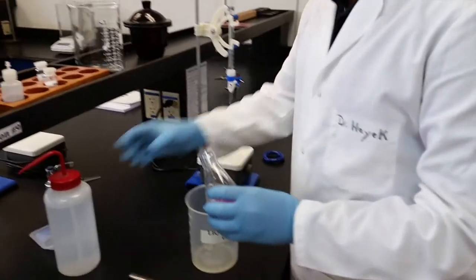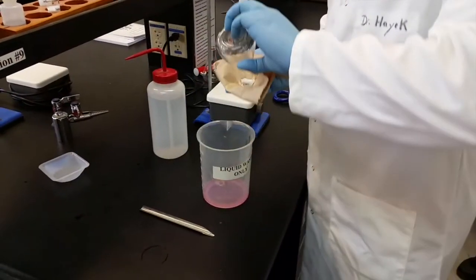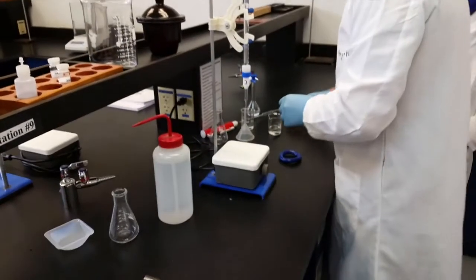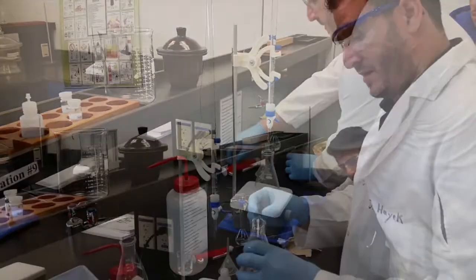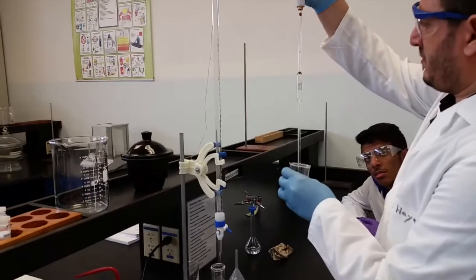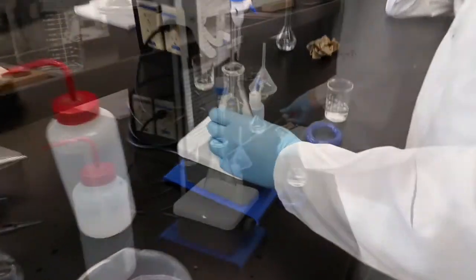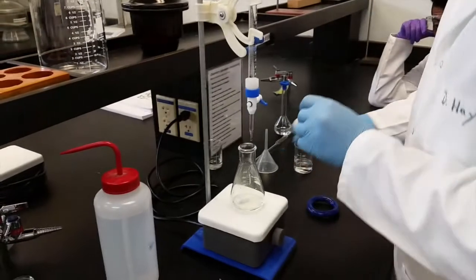I will recover my magnetic bar. Then I will take another Erlenmeyer flask and repeat exactly the same thing. So the new Erlenmeyer, 10 milliliter. Should not forget to add the phenolphthalein, 2, 3, 4, 5, 6.